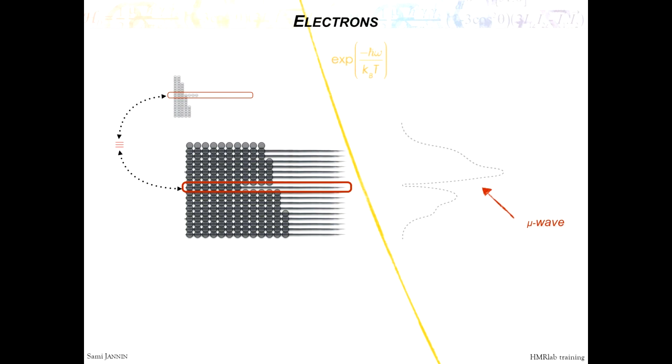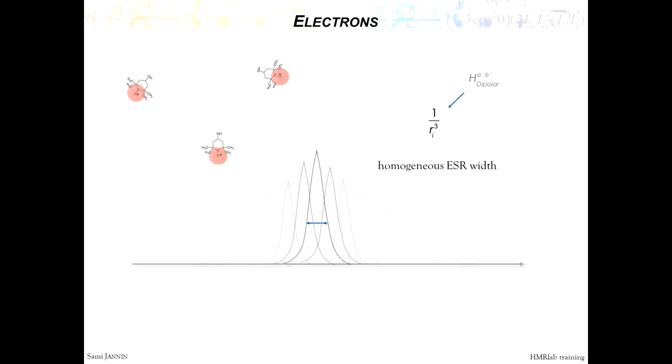That's not what's going on for us. Because we have what we call homogeneous broadening. We have dipolar couplings between the spins. So these packets of spin, they talk to the neighbors, and so it diffuses through the line. Okay.